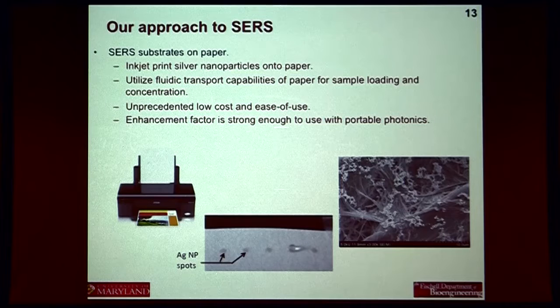Is your substrate flexible, can it be like a band-aid type? Yeah, we're using just filter paper that you can buy from Fisher in huge boxes. Some key aspects to the substrates: it cannot contain any chemical compounds that have optical properties. So we can't use printer paper for this, because it has all these chemical binders and agents to make it look nice and white and so forth.